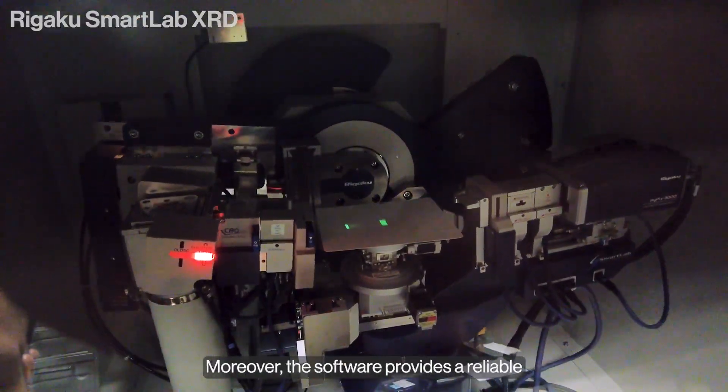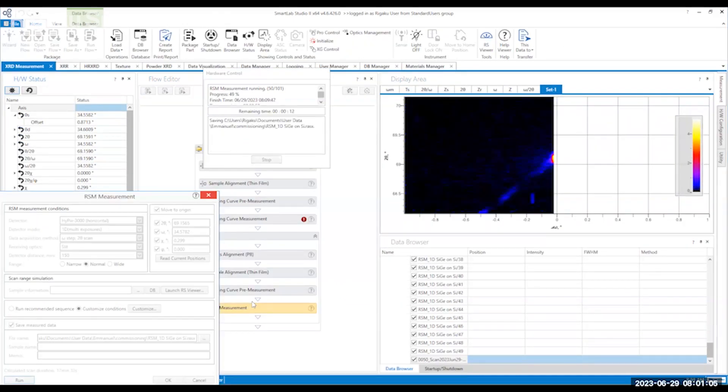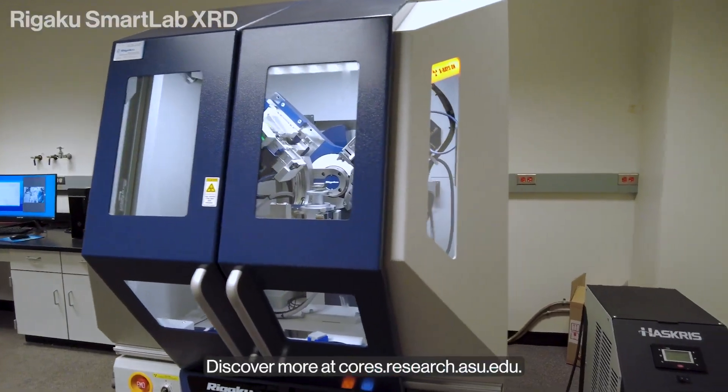Moreover, the software provides a reliable reminder to rectify any setup errors. The SmartLab truly is a smart instrument. Discover more at cores.research.asu.edu.